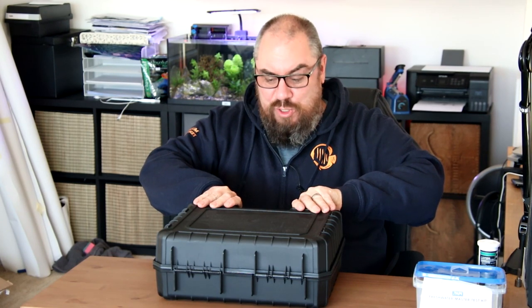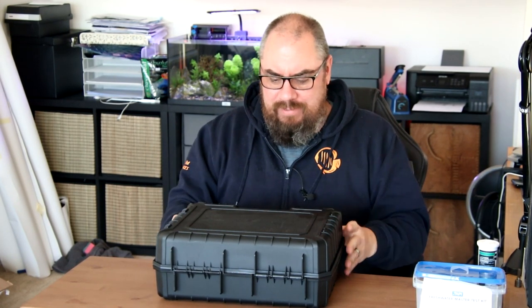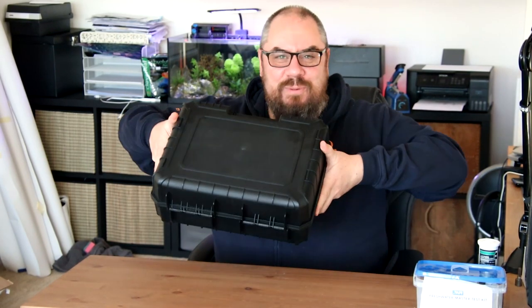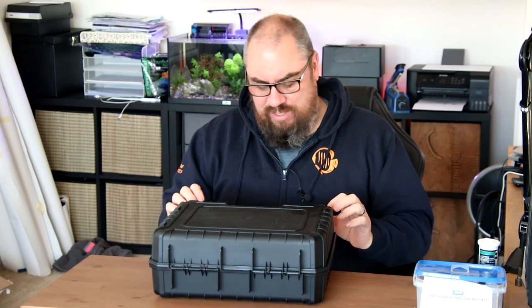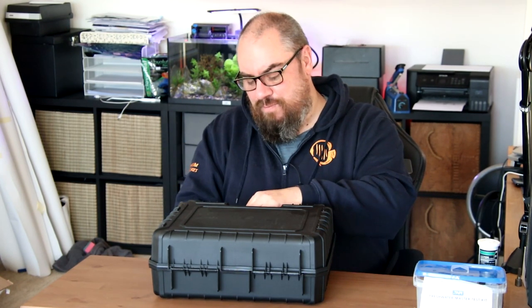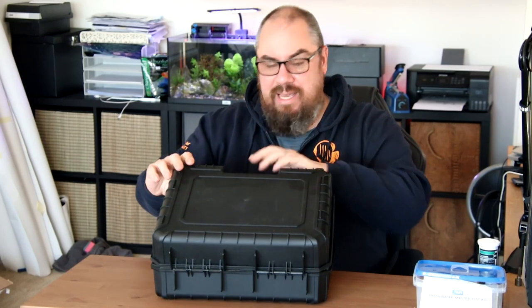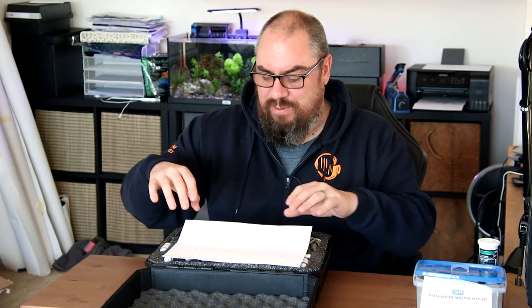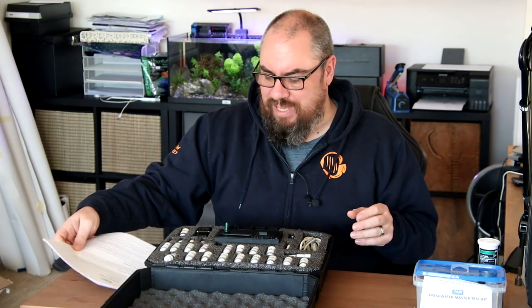If we dive into the box, I'll show you what we've got. It comes in a hard case, really sturdy and always looks good. It's basically called a mobile testing kit, used in various other industries, and they're developing one for the aquarium industry. The website's full of all kinds of people who use this sort of thing, and it's basically meant to be lab-grade equipment on a hobbyist budget.